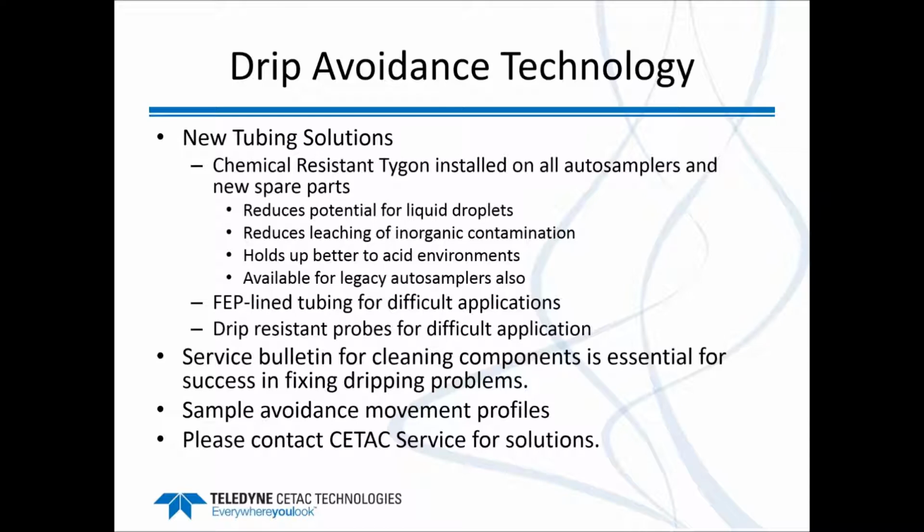It resulted in some observations that we received from customers saying that the Tygon they were receiving was falling apart, and it was causing the probe to retain an oily contamination, which caused the surface tension on the Teflon to change, and therefore water or acid to stick to it and fall off while it's moving, causing contamination.